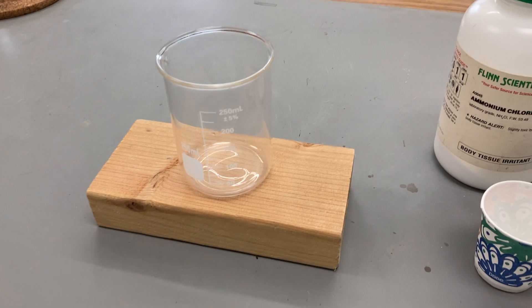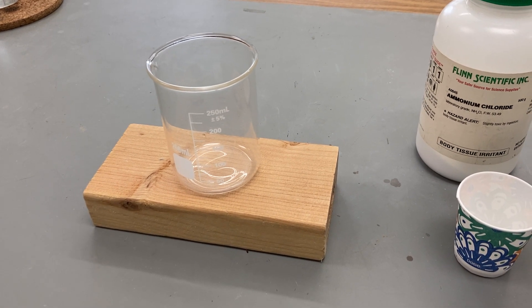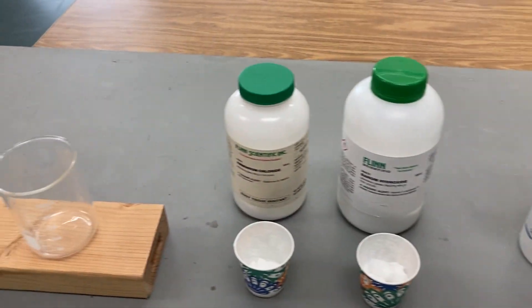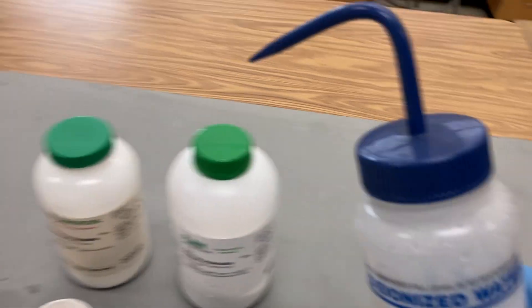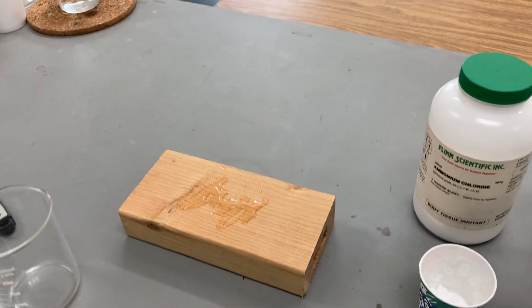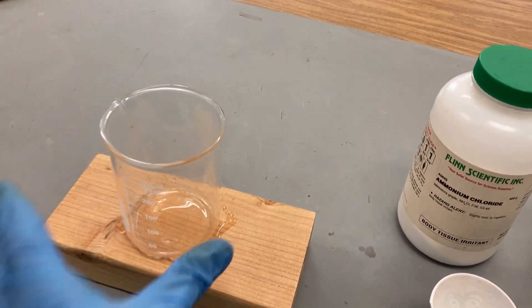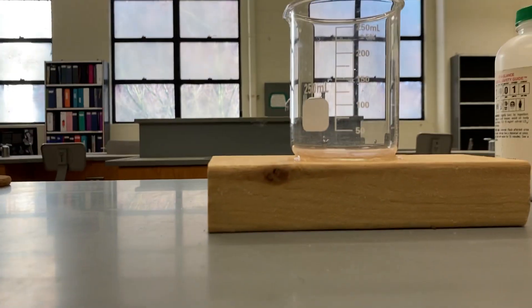We're going to be mixing them together in a beaker, and the beaker is on a piece of wood. I'm going to take this off — I have a little bit of distilled water and I'm going to put a little bit on the block, and then set the beaker up on top of that.